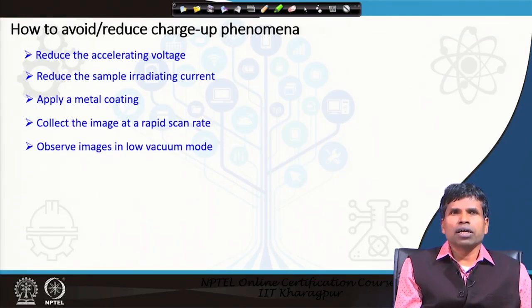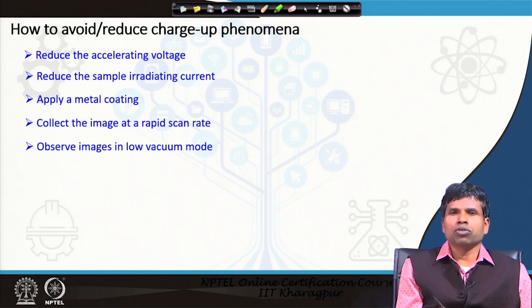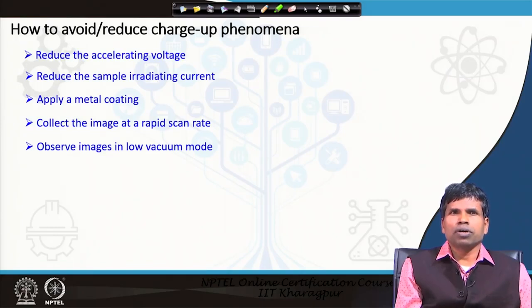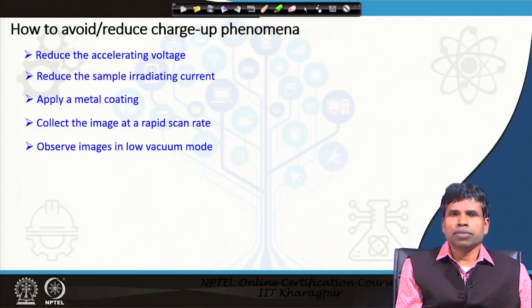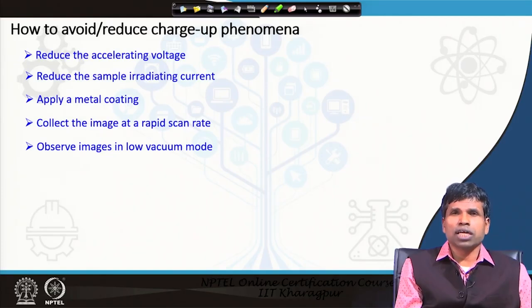Fourth, collect the image at a rapid scan rate — when you collect the image with a rapid scan rate, the electron beam does not stay longer at one point, so fewer electrons accumulate at the surface and charge build-up will be less. Fifth, observe images in low vacuum mode — in low vacuum mode, the energy of the incident beam will be lesser and therefore charge build-up will also be less. These are the different ways to avoid or reduce the charge build-up phenomenon.